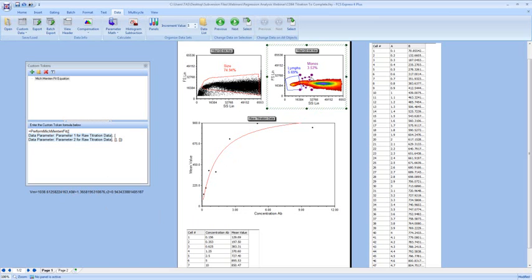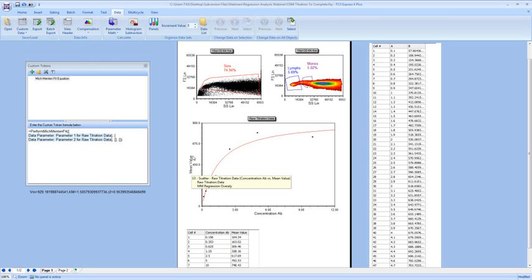What we can now do, now that we have this, is probably extract some useful values from it rather than just seeing the trend line and the curve. So since this is an antibody binding assay, what we want to do is find out where 90% of the Vmax is, or 90% of the maximum value is, and then we want to associate that with the concentration of antibody used. So we're just going to use a custom token here again.